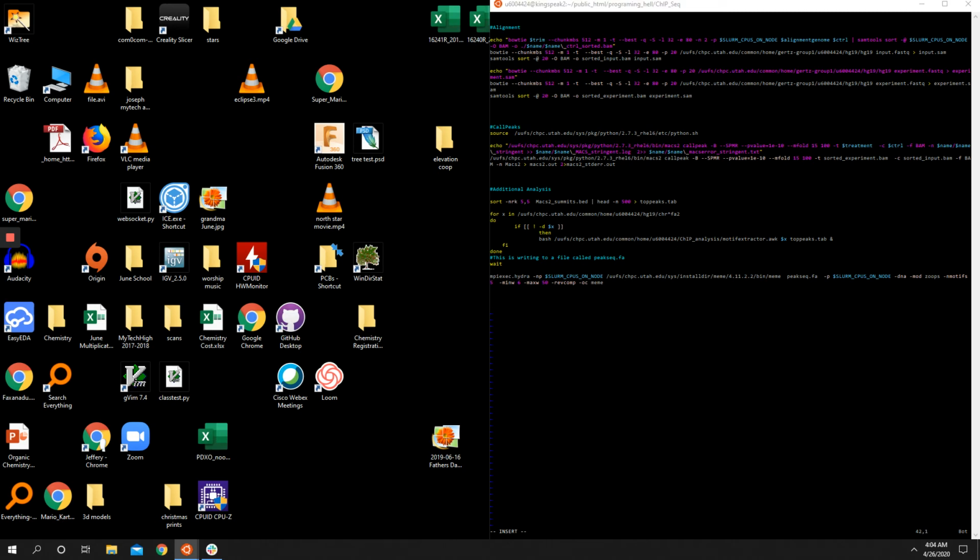And so that'll make a folder called meme with all the little files that meme outputs into it. Okay. Let's do one more thing here. We'll just call this good actually. My pipeline runs CISH, but that's a little convoluted in how we do that.